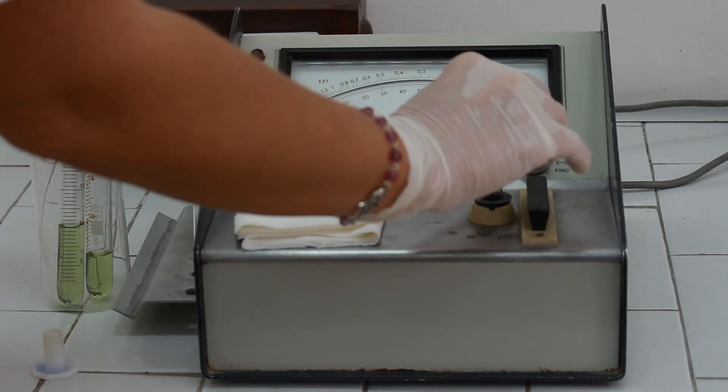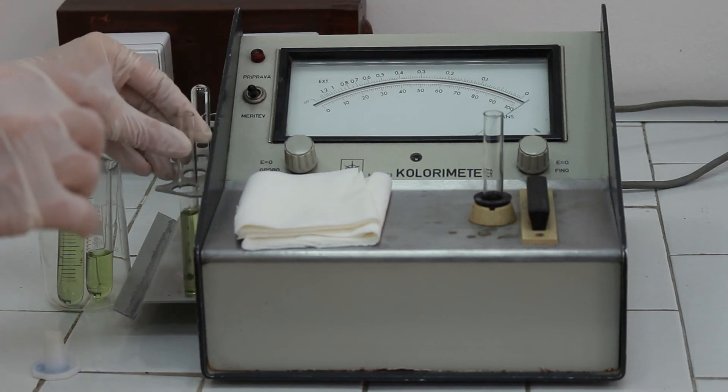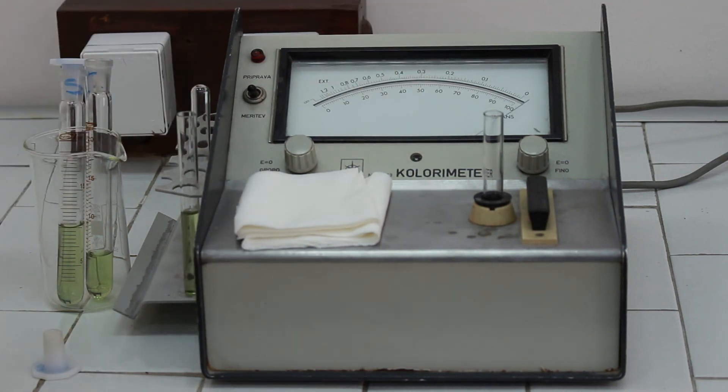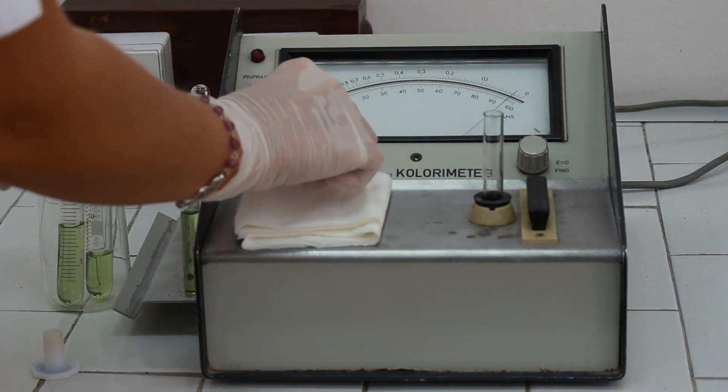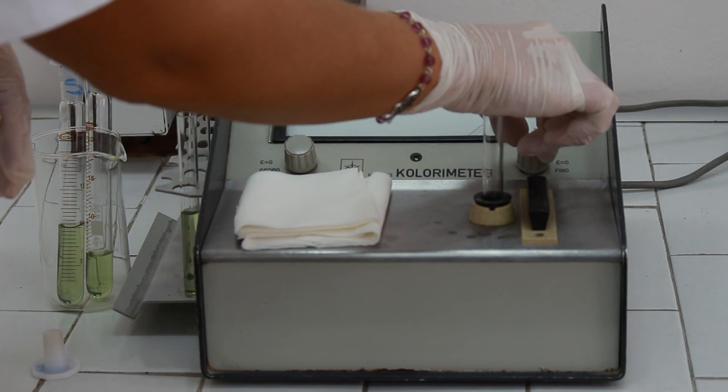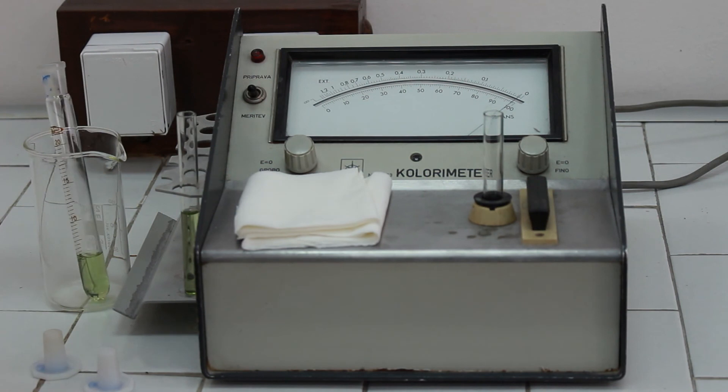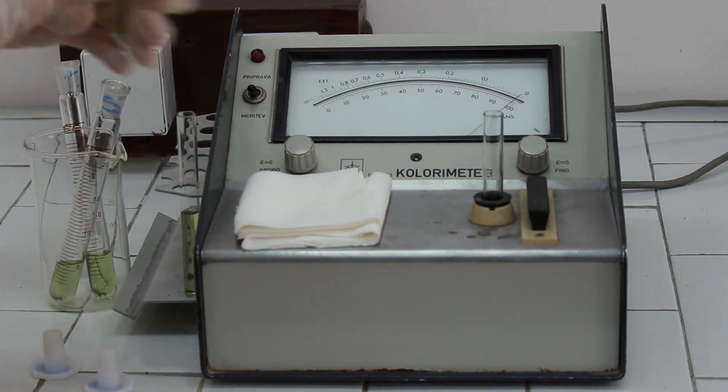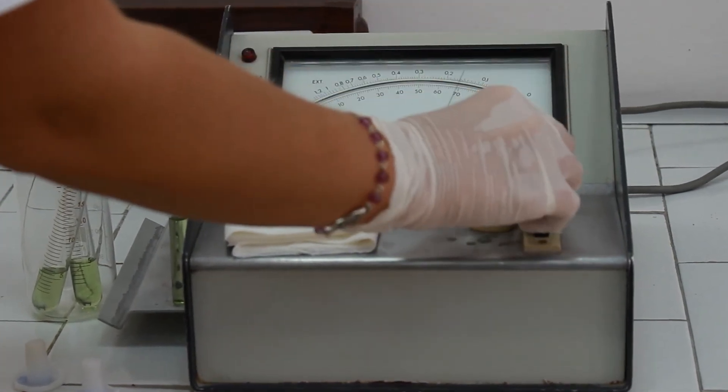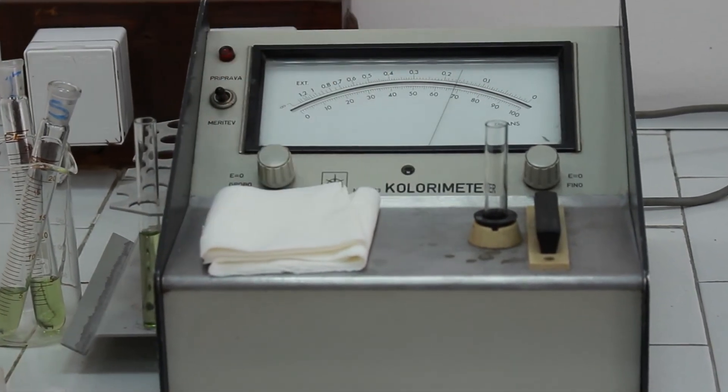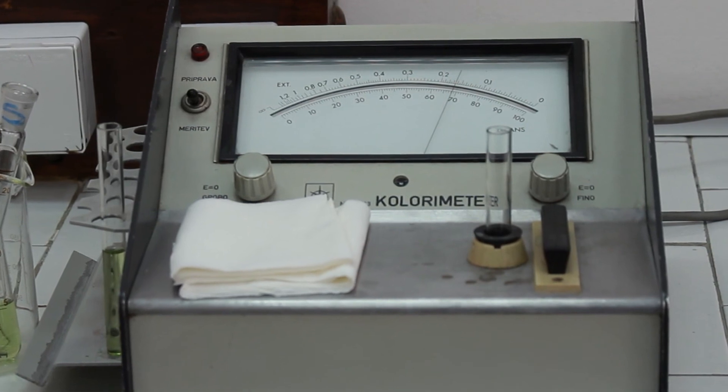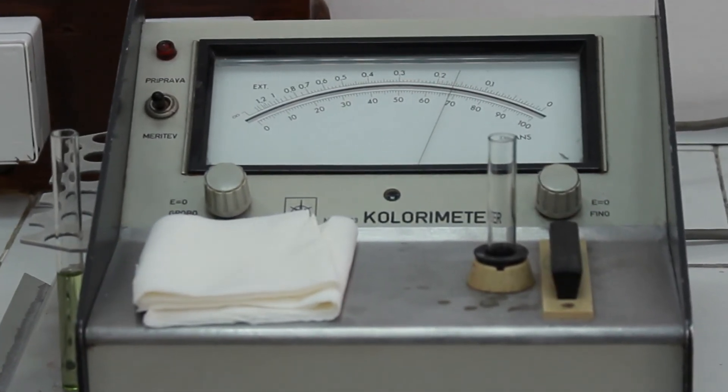We are going to put back the blank solution just in case the zero point is changed. If it's changed, we have to adjust it again. Now we have to pour the standard solution to the cuvette, put it to photometer and read the absorbance at the upper scale. Now we can calculate the results.